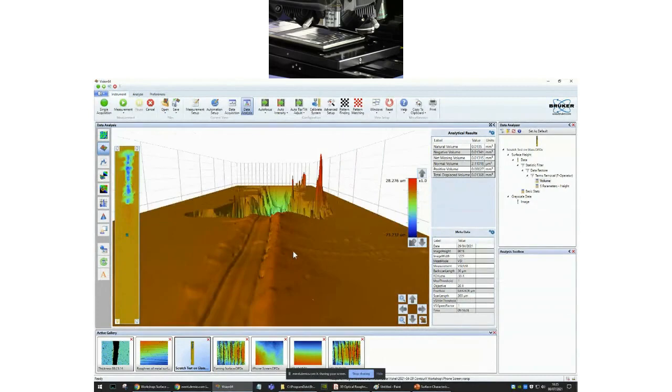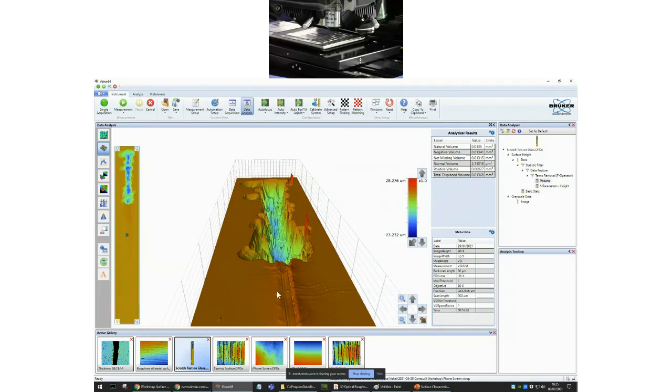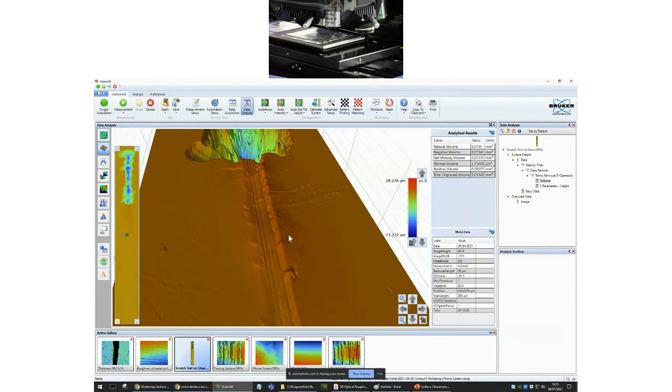And that's because we are basically causing quite severe damage to the piece of glass here. And actually, you could even see smaller fractures before it completely fell apart. So that's what you're seeing here a little bit. So there's a lot you can do there.